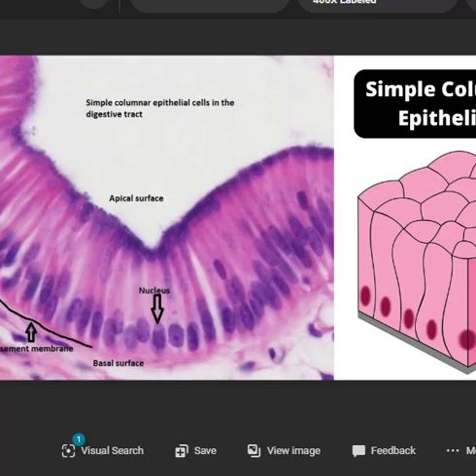Now, before I forget, the squamous epithelial cells, the cuboidal cells, the columnar cells, if there's just one layer, like here there's just one layer, here's one tall skinny cell, here's one tall skinny cell. So if it's just one cell layer thick, then we say it's simple. So this would be simple cuboidal, simple columnar epithelium. And the one we saw before was simple cuboidal.